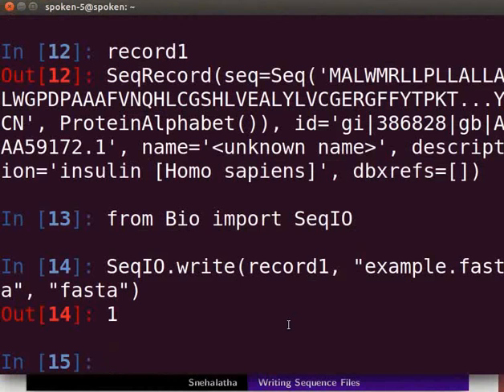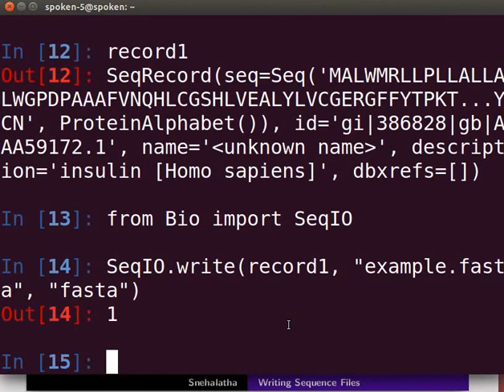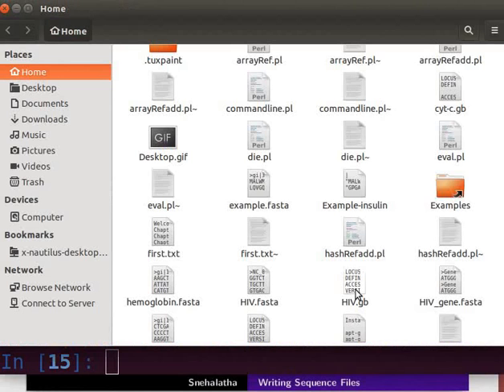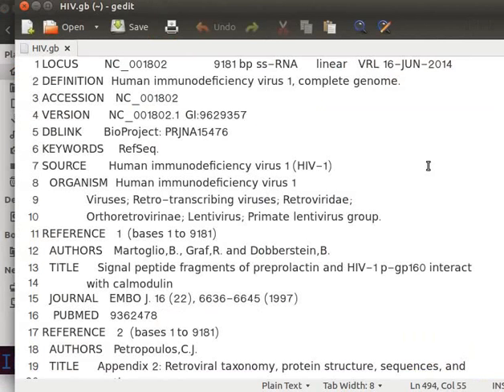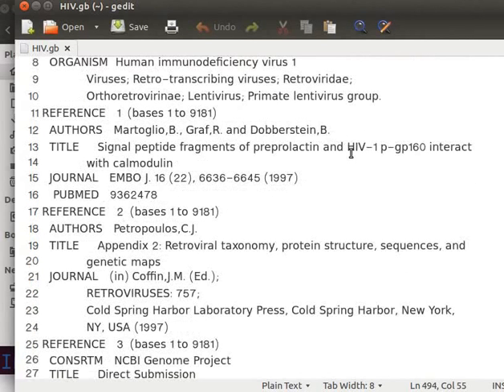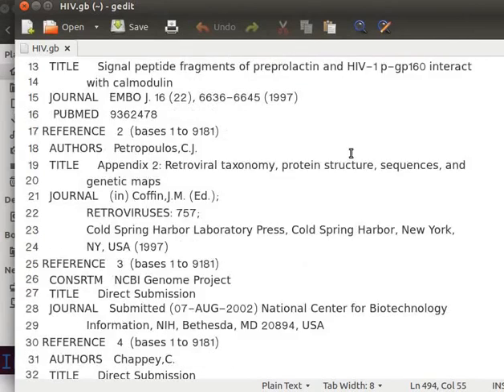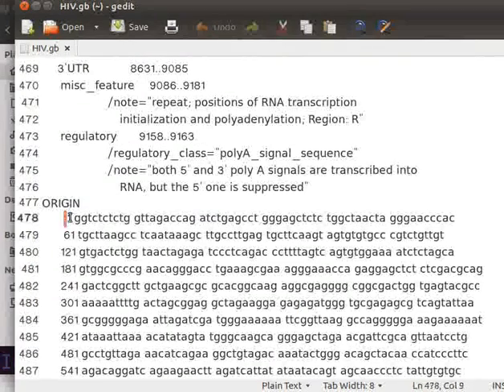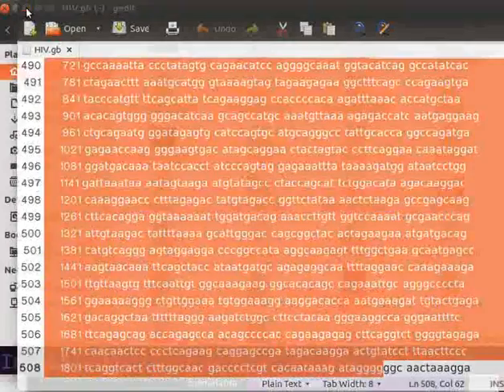Many bioinformatic tools take different input file formats, so sometimes there is a need to interconvert between sequence file formats. We can do file conversions using the convert function in the SeqIO module. For demonstration, I will convert a GenBank file to a FASTA file. I have a GenBank file in my home folder. Let me open it in a text editor. The file contains the HIV genome in GenBank format, with descriptions of all genes in the first part, followed by the complete genome sequence.